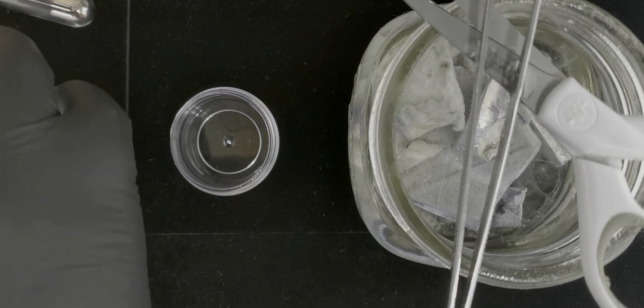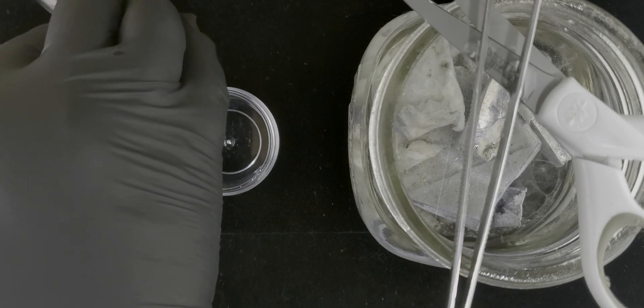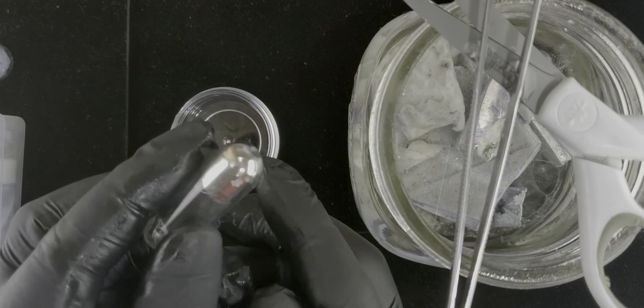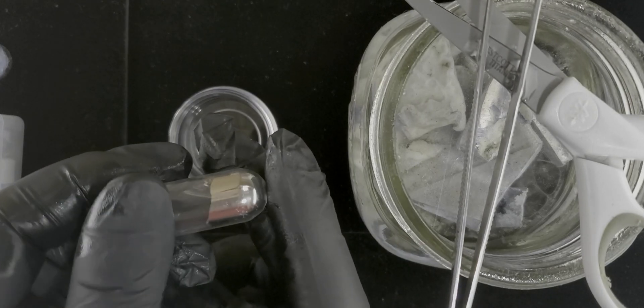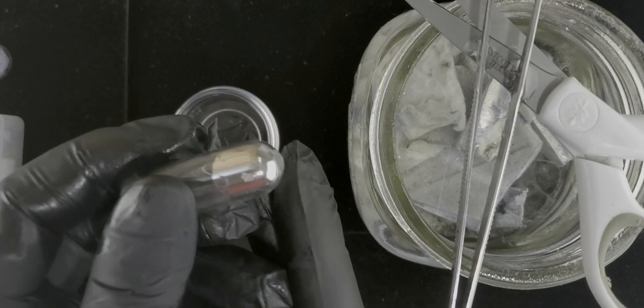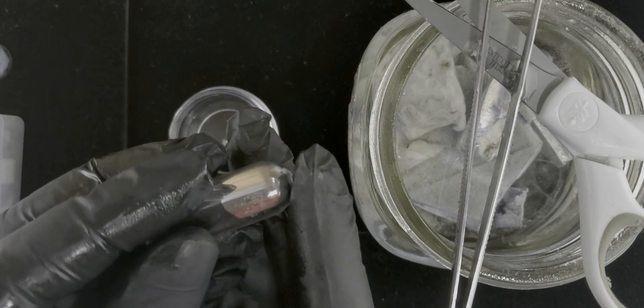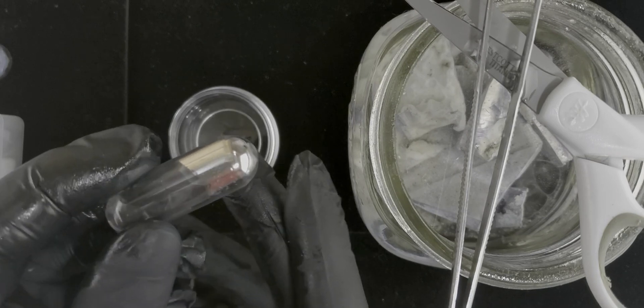But it is kind of an expensive metal to be tossing much of it into water and not to mention a little bit dangerous. This is, however, what it looks like if it has no oxidation at all. I mean, it is absolutely pristine. But in order to make these ampoules, you need special equipment, obviously.